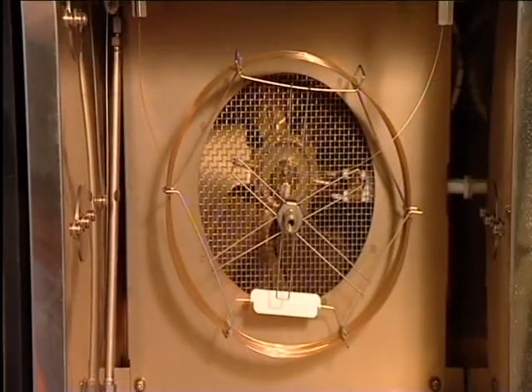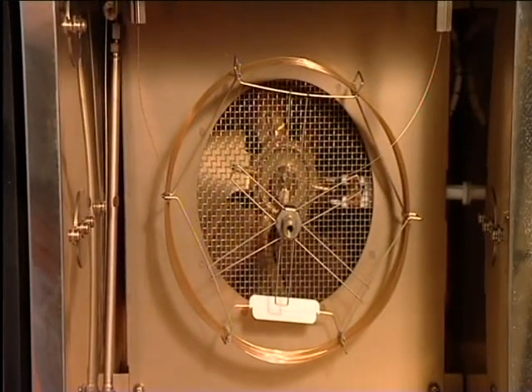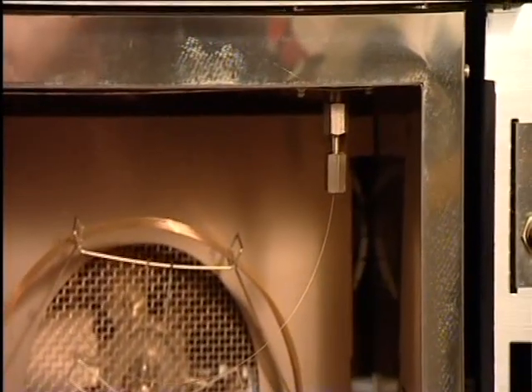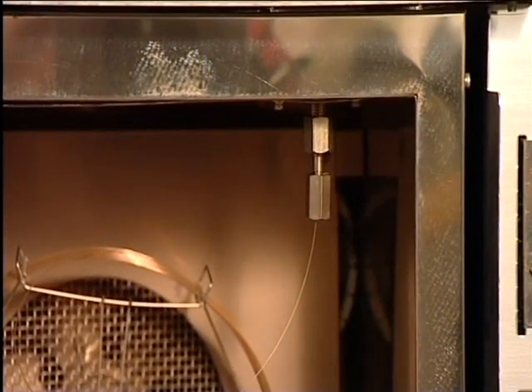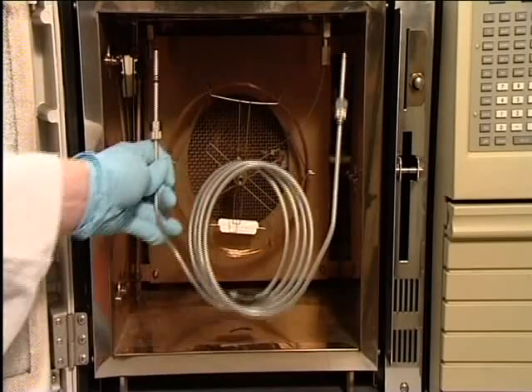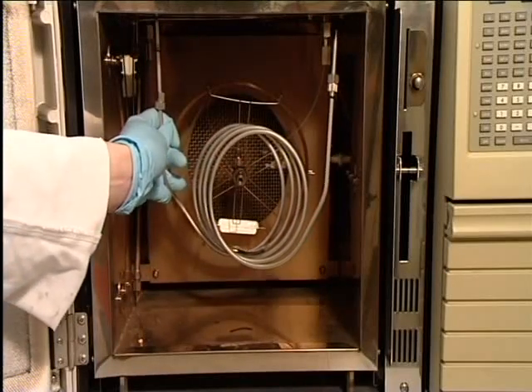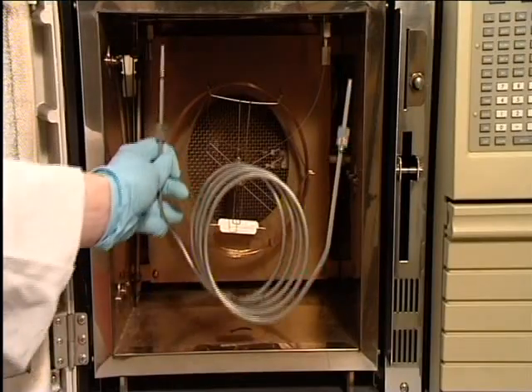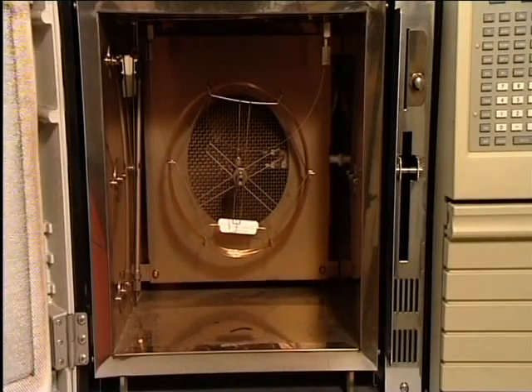This capillary column is 30 metres long. This is much shorter, about 1 metre. The properties of the column and its filling are chosen for the particular separation that is to be carried out.